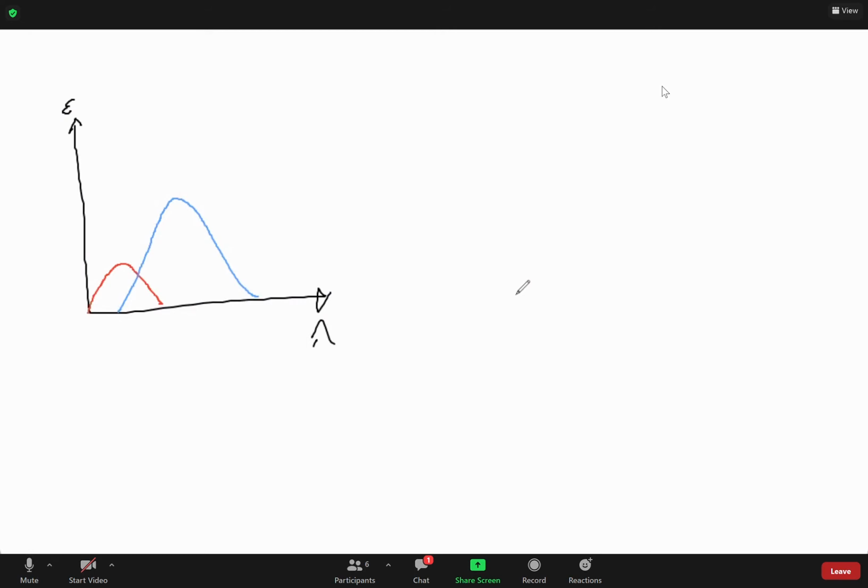Has anyone read what the goal is here? So you've got different data sets, and one of the differences is that you've got different initial concentrations in your pure compound, so you'll have different absorbances and different concentrations, but you'll have the same extinction coefficients. And then the other difference is that you get a different unknown mixture. So what are we trying to do with that unknown mixture that required us to calculate the extinction coefficients? Determine what it is. Yeah, exactly.